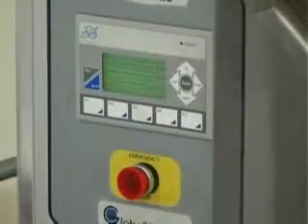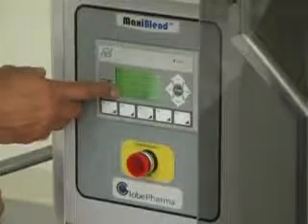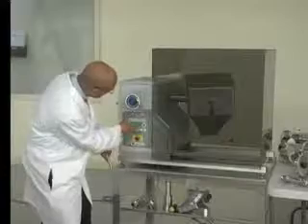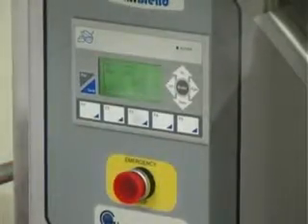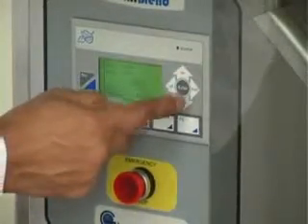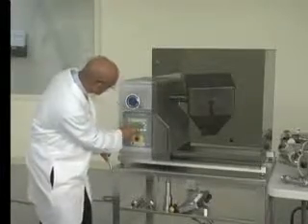Now we will set the intense fire bar time. For bar time you have to press F3. Then you can set the bar time by scrolling up or down again, then press enter.